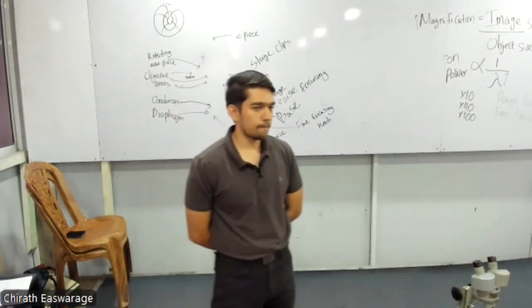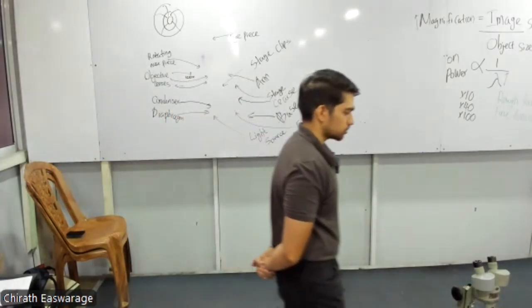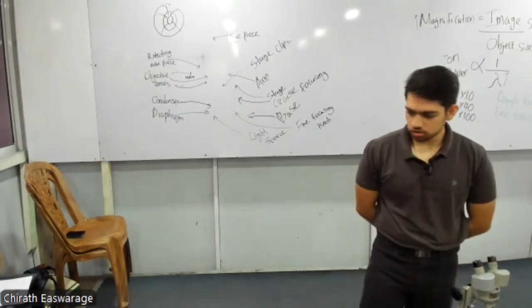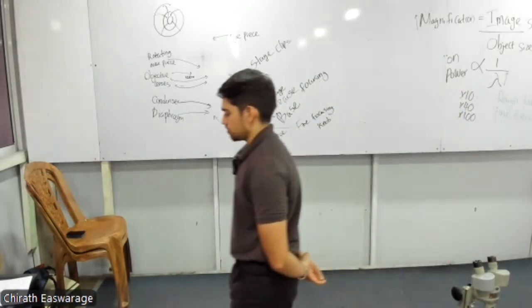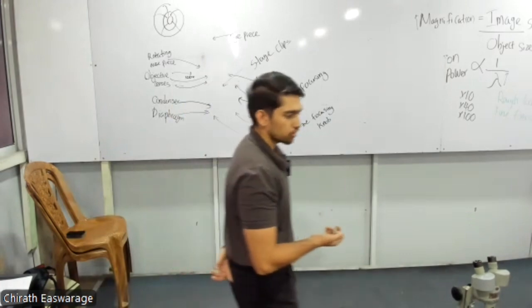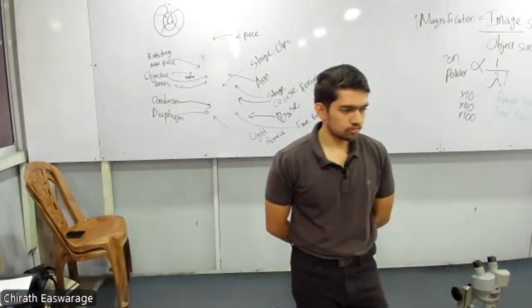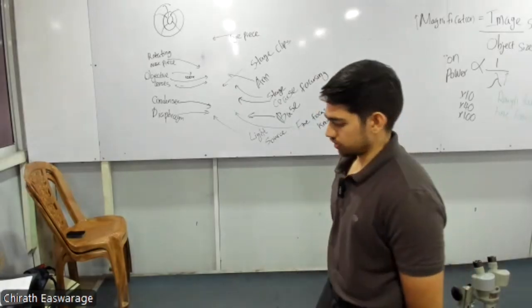Then stage. Used to mount the specimen for observing.